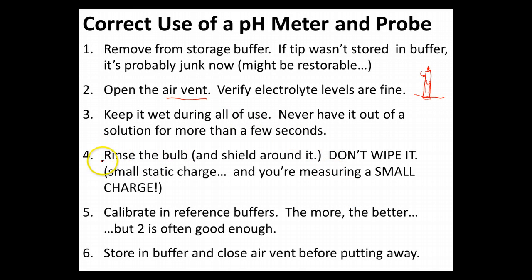Right before you're going to do your measurement, rinse the bulb. Make sure you rinse the shield around it too, because you're going to have little droplets sticking on the inside. You don't really want to be carrying outside buffer solution into your analyte, or transferring analyte from one place to another.